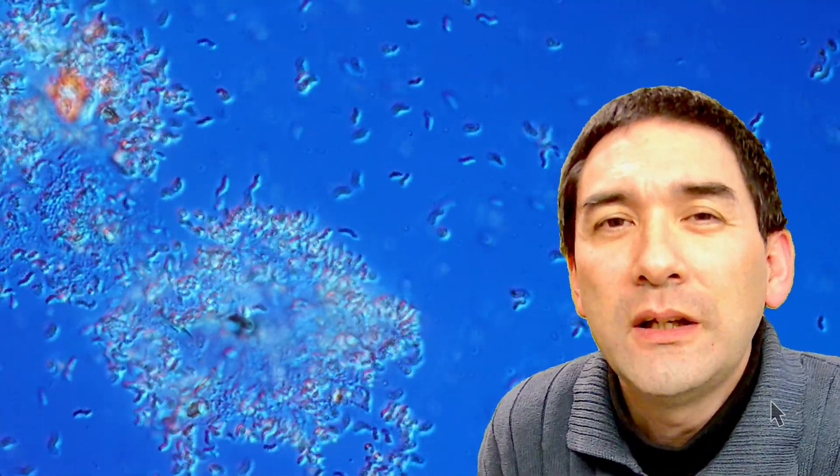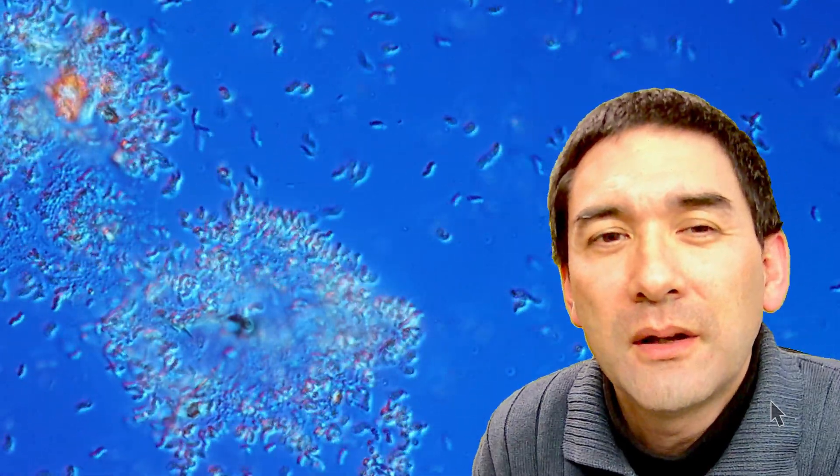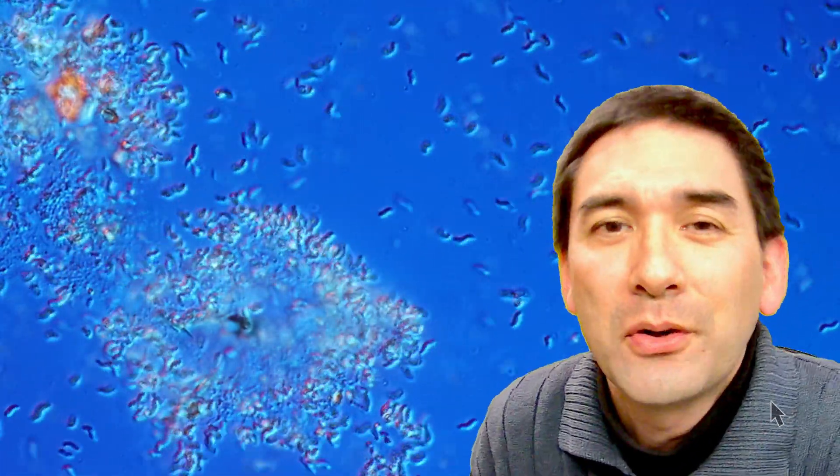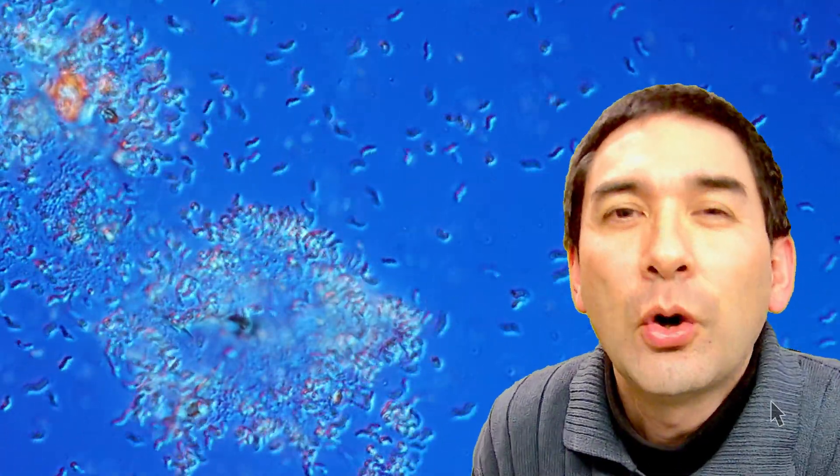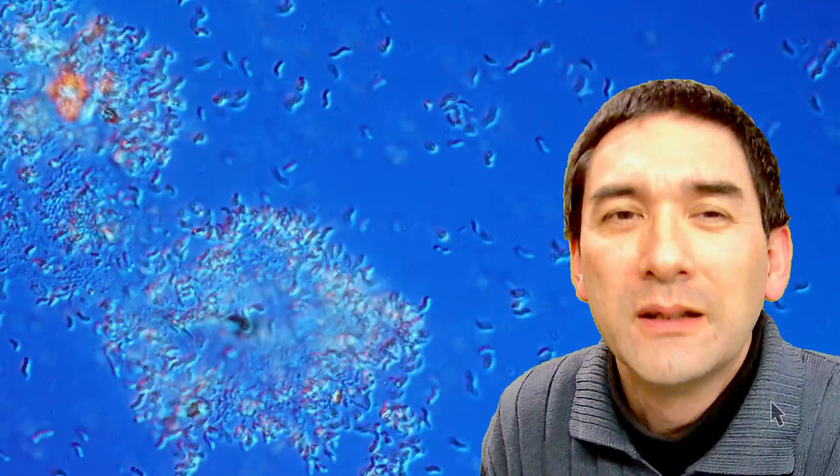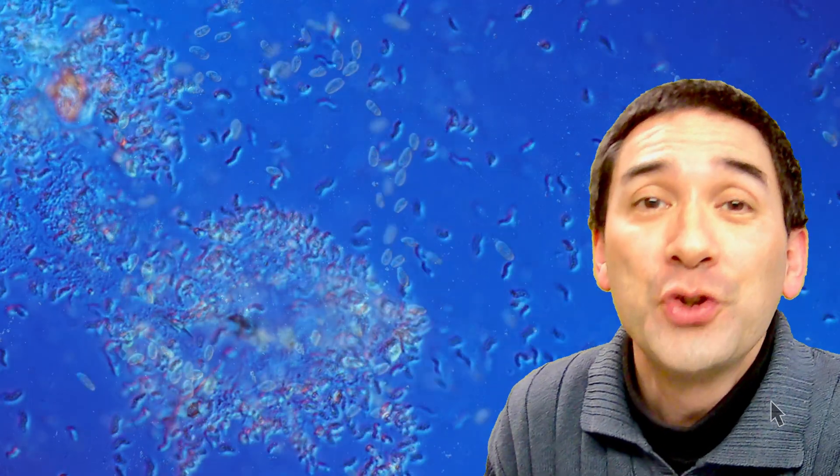because you don't really know what they're doing and I do not automatically expect them to be dangerous because they are water organisms. But at the concentration like this, you should be a little bit careful and they are also eaten up by the protozoa that you find here.